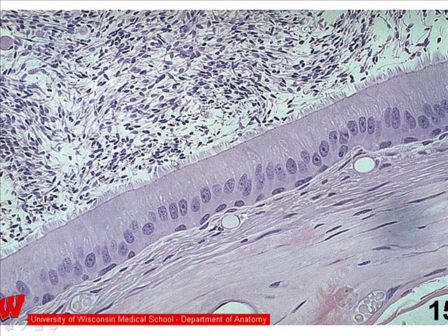There are very long processes coming out of the apex, and these are called stereocilia. They are long microvilli filled with actin filaments, and they play a role of increasing the surface area of the epithelium, because what this epithelium is doing is resorbing some of the residual fluid and some of the cells and portions of cells that exist in the lumen.